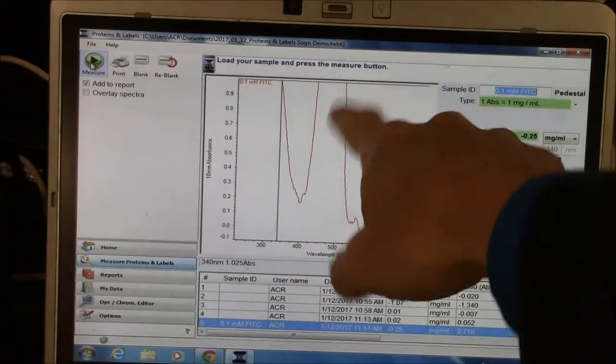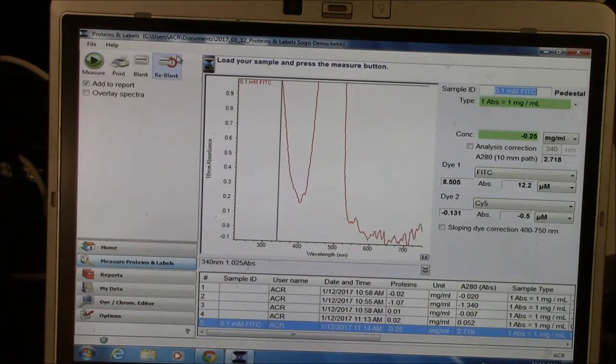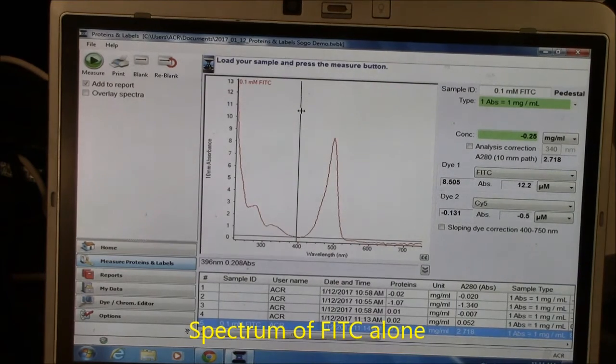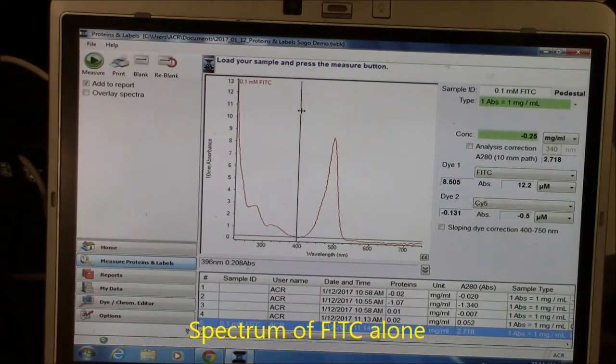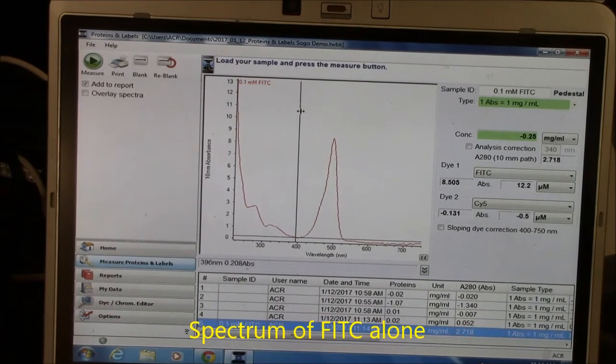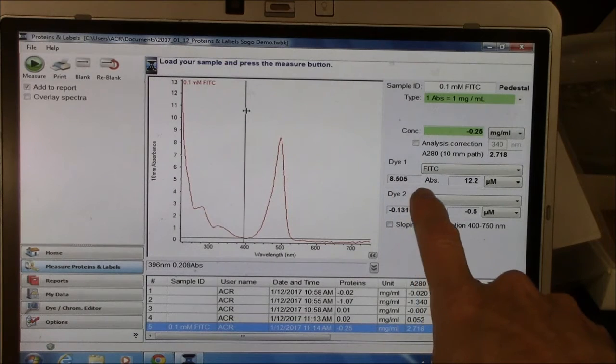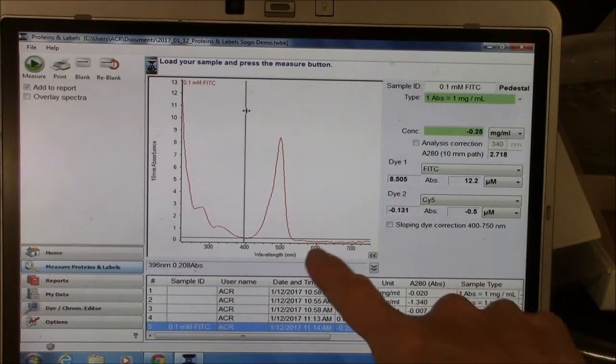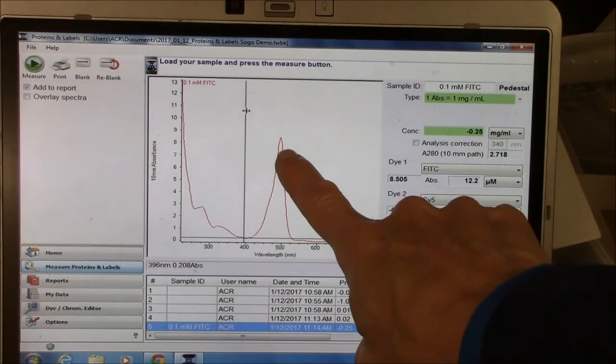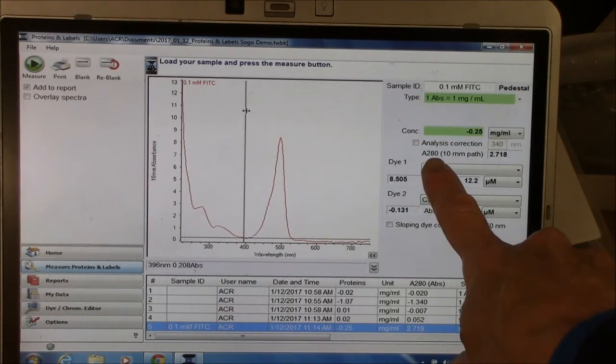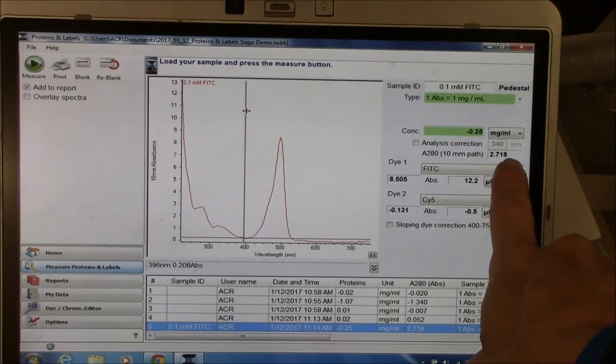This is my spectrum here, it's off scale, so I'll double click here. And this is a pretty good spectrum for my FITC. There are two important numbers here. One is measuring the absorbance at 495 nanometers, which is this peak here. And the other is measuring the absorbance at 280, and that's this number here.